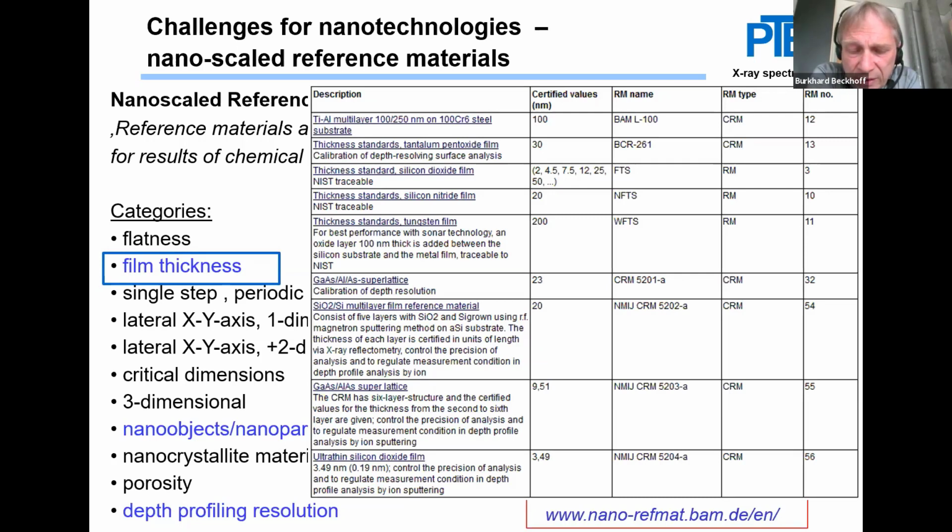And this demonstrates very nicely the analytical challenge, because the reliability of analytical results depends on the similarity of the sample that you would like to analyze as compared to the reference materials, or to be more precise, the spatial and compositional distribution of the matrix elements within a reference material.